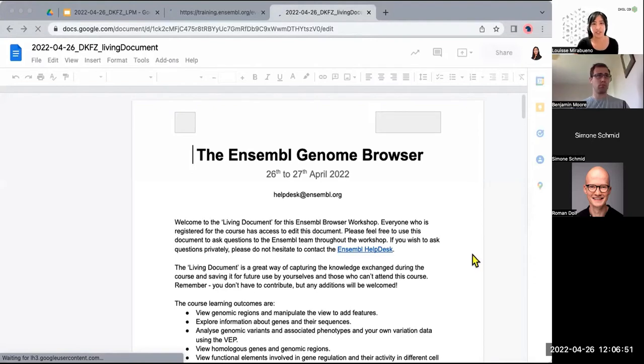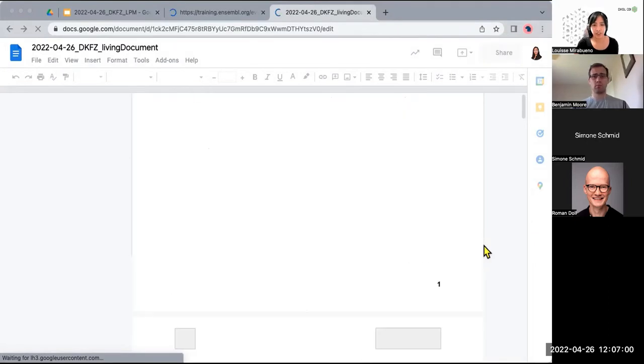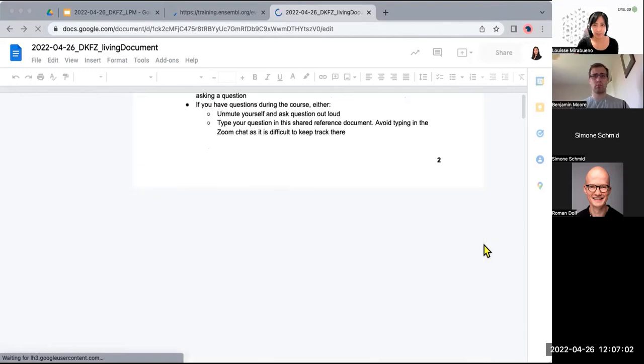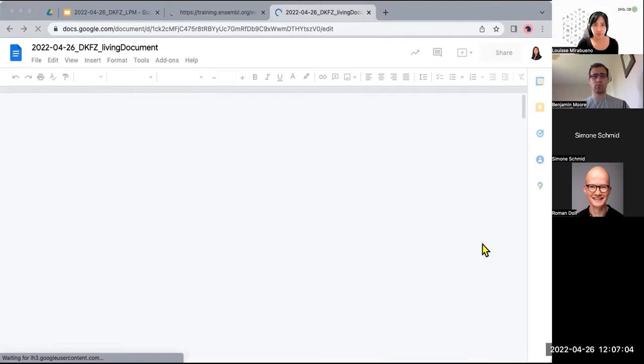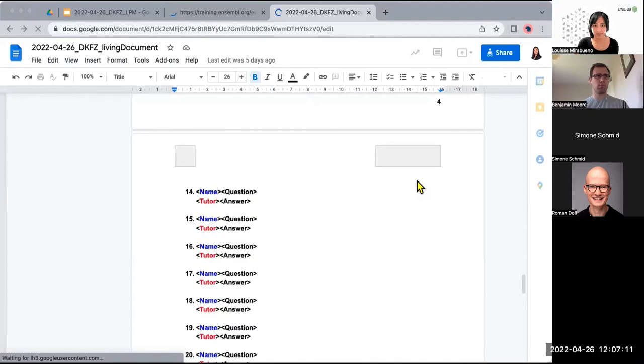It's loading slowly, sorry about this, but I will scroll down to the bottom just to show you how the question section looks. Here it is.